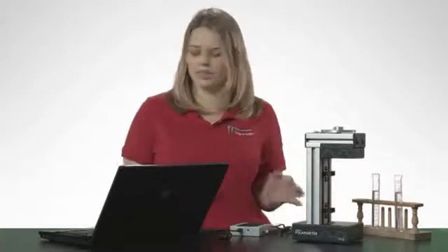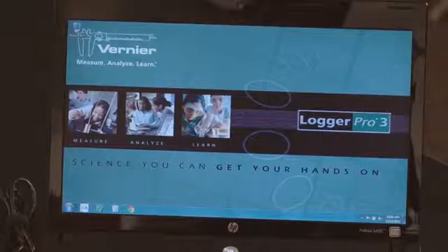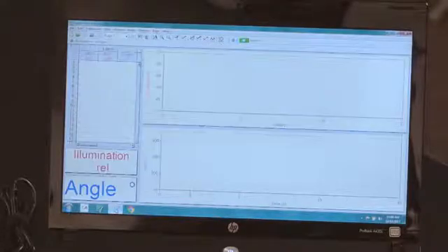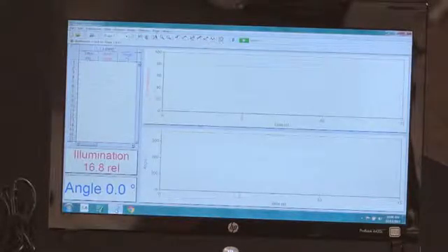Now that I have everything plugged in I'm going to open Logger Pro. You need to have Logger Pro 3.8.5 or newer for the polarimeter to work properly.